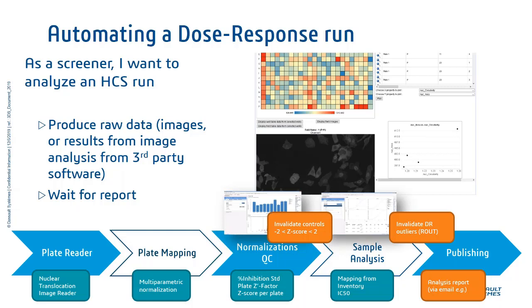So, once again as part of the autopilot feature, we have added a notifying system, which is fairly simple. You receive a report via email. This report contains the information about how the analysis went, where things went wrong or things went well, and we're going to talk about it afterwards.